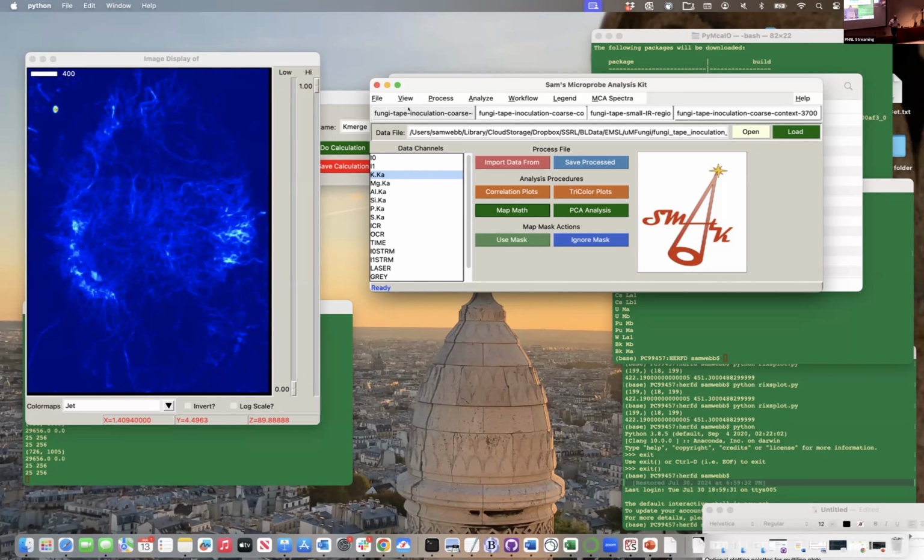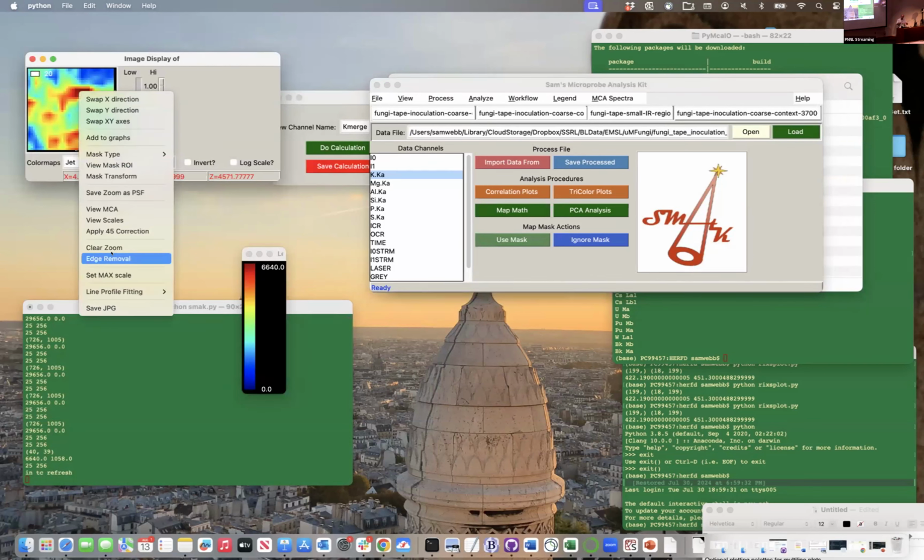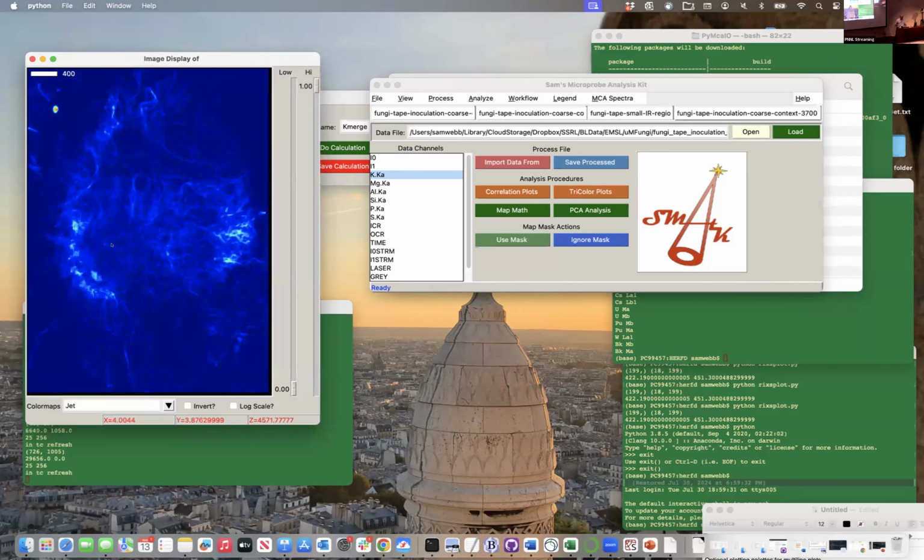So if we zoom into the map here, you're going to see that the pixels are bigger and they're being resampled. It actually does a bicubic sampling, so it kind of smooths through it a little bit, so it's not just big blocks. It's basically blurring the data on a 5-micron grid, effectively, this bicubic sampling. You're not magically gaining resolution, but it's putting it onto a better scale.